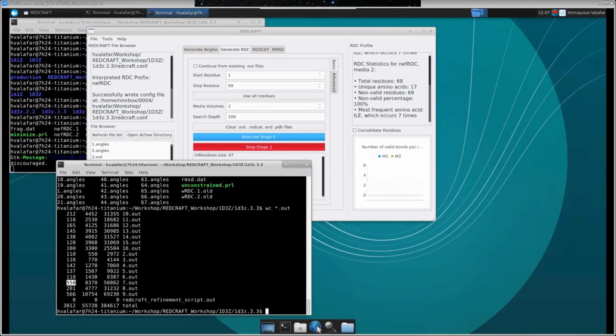Okay. 10 of those 100 structures will be subjected to minimization. And therefore, the 10 additional structures that you see in all of them, such as, for example, in 2.out, 10 of them are the contribution of the minimization, where the 10 top structures will be selected, minimized, and then inserted back to the list of potential structures. The remainder of it is the contribution of decimation.